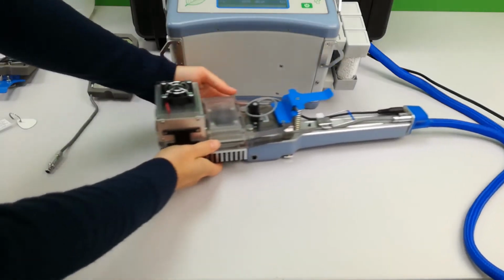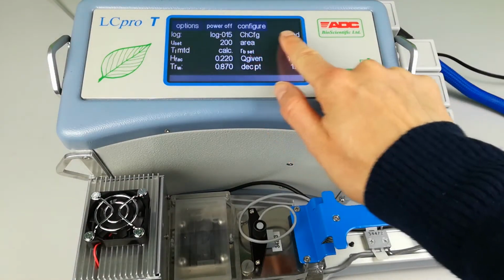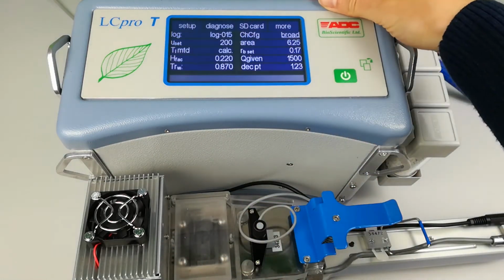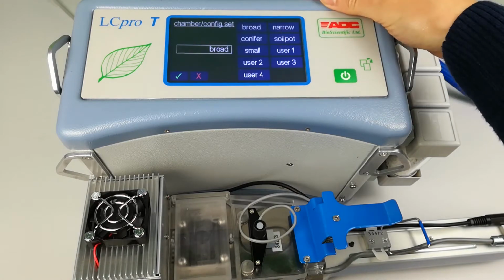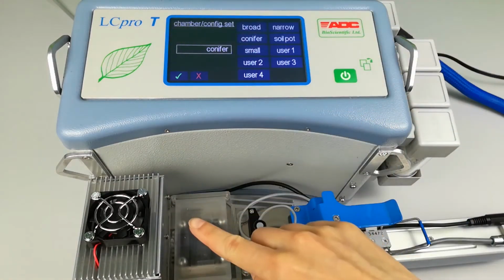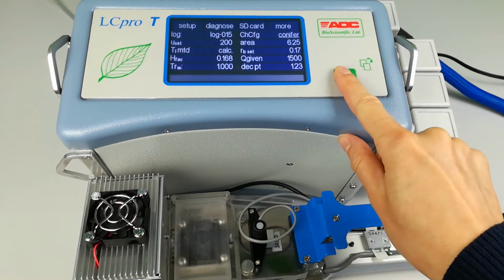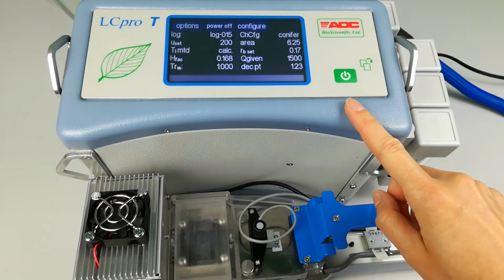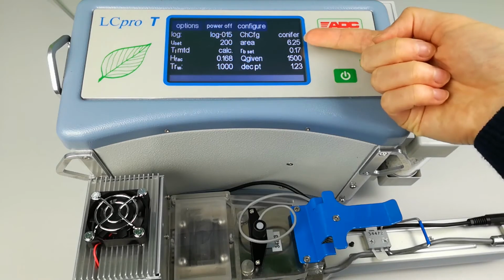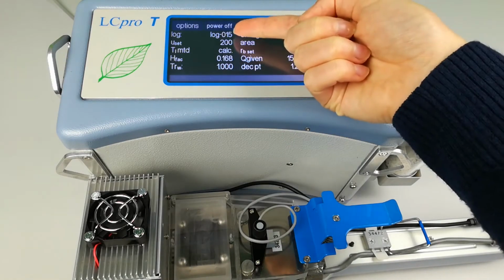Find the Configure menu and we want to change this to Conifer. Find the Conifer option and use the tick to select. You will note that the parameters on the configuration page now change to read Conifer: the leaf area, boundary layer resistance, the log file, flow rate, temperature method.